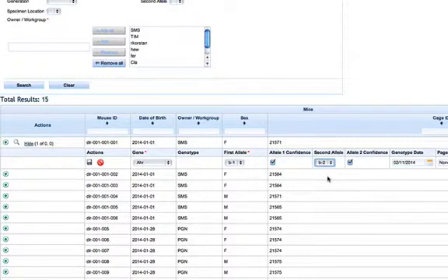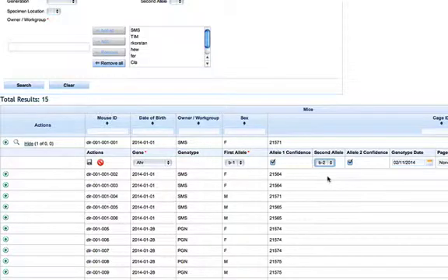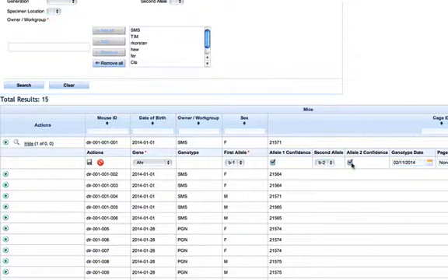Genes and alleles can be configured any way you'd like using the administration screen. You must select a first allele, but the second allele is optional. You can click the confidence checkbox to specify how confident you are in the allele call.